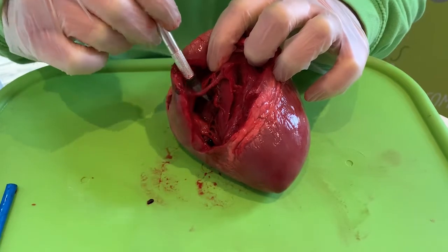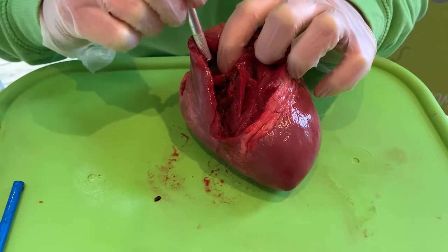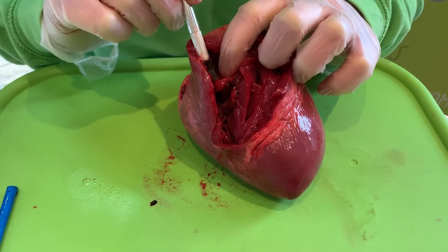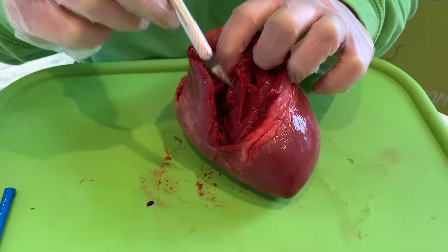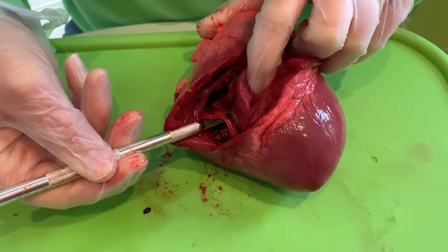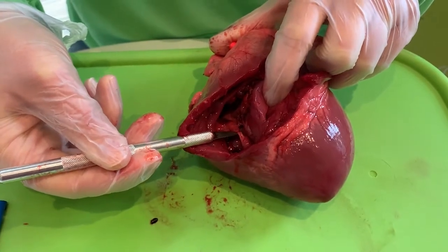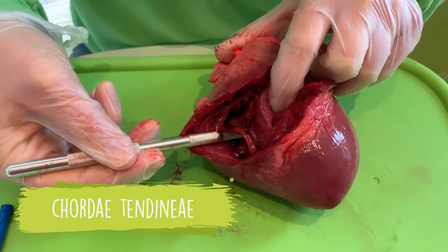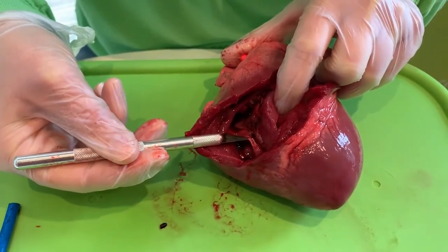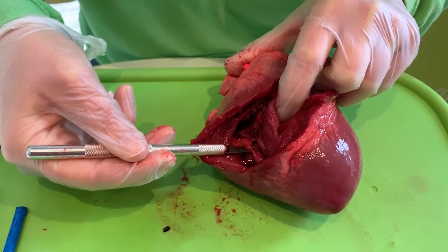And then underneath the moderator band, underneath here, oh, pull that out of the way. This is one of the valves, okay? So this is one of the valves that lets the blood move through the right side of the heart. And down here, at the bottom, these are heartstrings, okay? So this helps with the heart when it beats, okay? When it contracts and the blood moves through. And they're called chordae tendineae, okay? And we call them heartstrings, and sometimes people say, ooh, they're pulling on my heartstrings, okay? You might have heard people saying that, but they are very important to our heart beating.